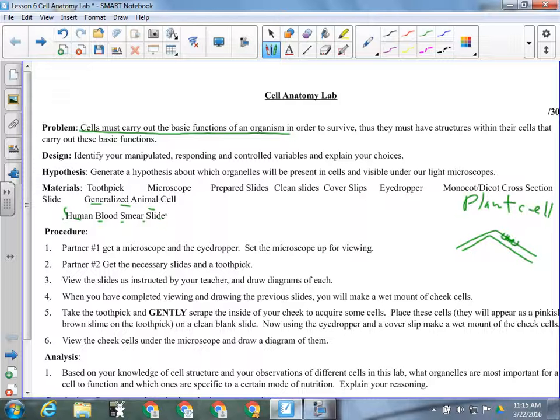And then anything that's the same for all the times you look through the microscope. A lot of these will be similar to your microscopy lab, but there's going to be one controlled variable that will be different. We're looking at cells from a plant, we're looking at cells from an animal, and a cell from another animal, you. Animals and plants all have a certain kind of cell that we named and talked about yesterday. That is something that will need to go in as a controlled variable. You will have to look it up, but it needs to be in there as a controlled variable. All the cells we look at are a certain kind.